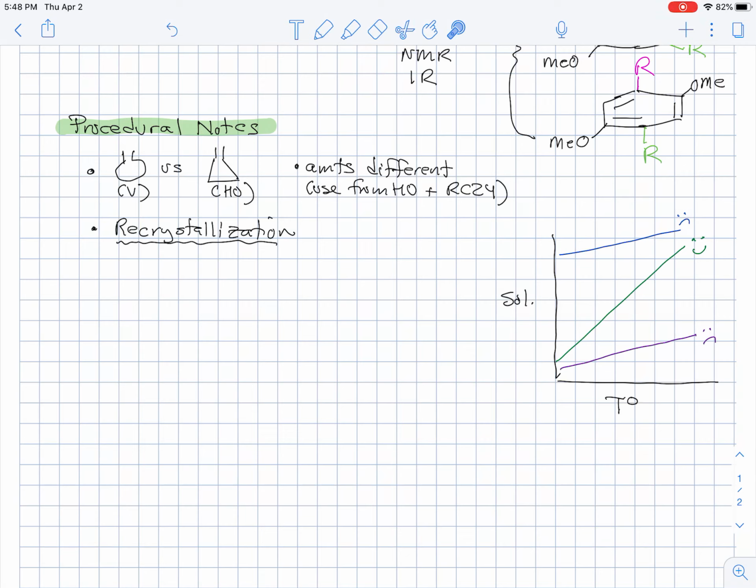So one thing I wanted to mention about the video is that apparently he had a stockpile of crude material. So what he does is he actually sets up the recrystallization with some of the stockpile material before he actually makes it in the video. And that's pretty confusing if you're not aware of it. I had to watch it a couple of times.